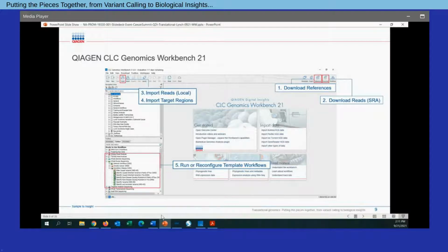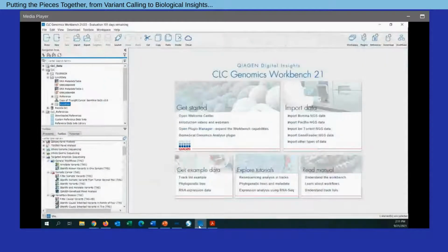So what I'd like to do now is to switch over into the Genomics Workbench. And again, I'm just going to quickly walk you through some of the steps I just mentioned. So this is the primary interface of the software, and we're going to show you how you can quickly and easily accurately call variants using this interface. Now, for everything that I'm showing today, I've actually run the analysis locally on my machine. So we can, in fact, accommodate local analyses on a laptop or a desktop.